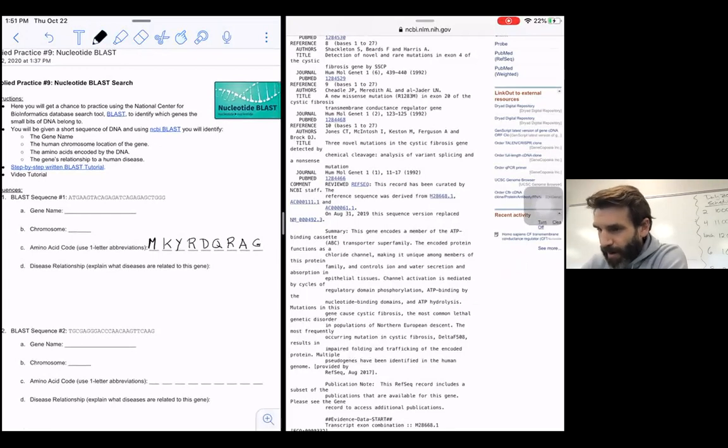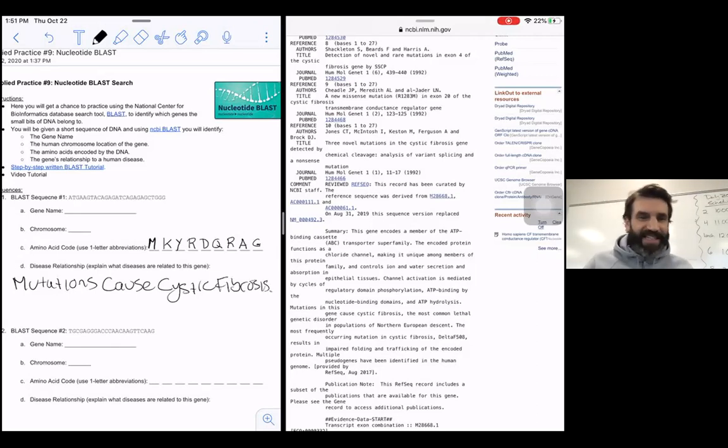get over here. I'm going to write mutations cause cystic fibrosis. All right. So you could maybe type in there too. I just want to go a little more quickly for you.